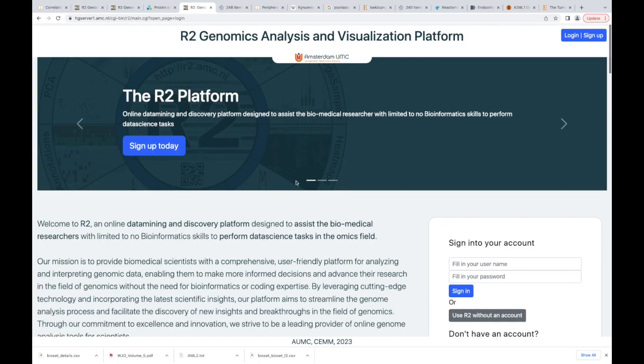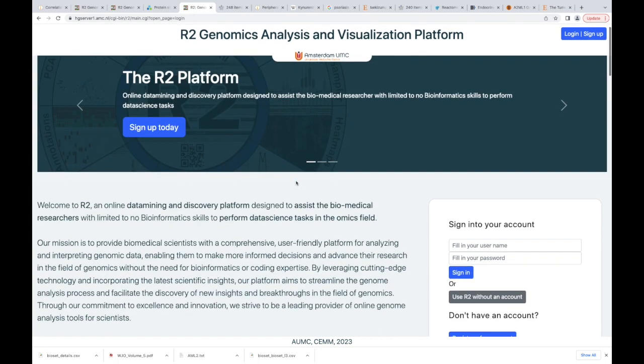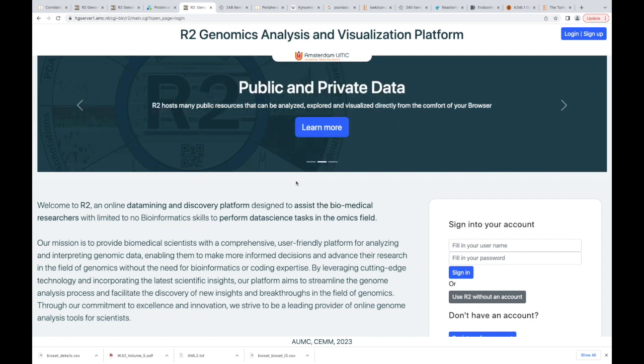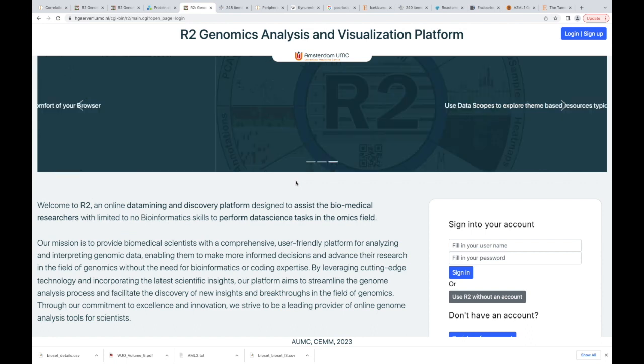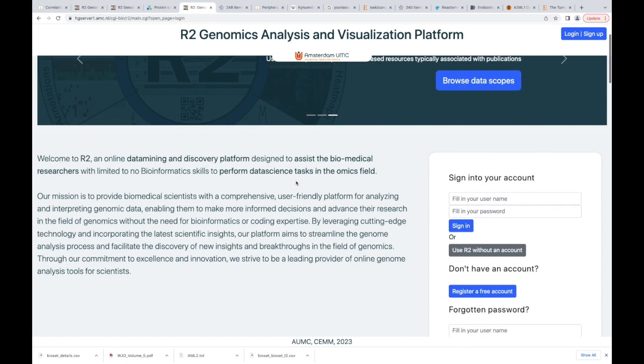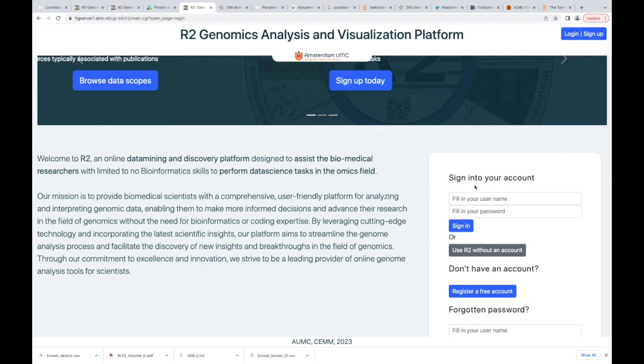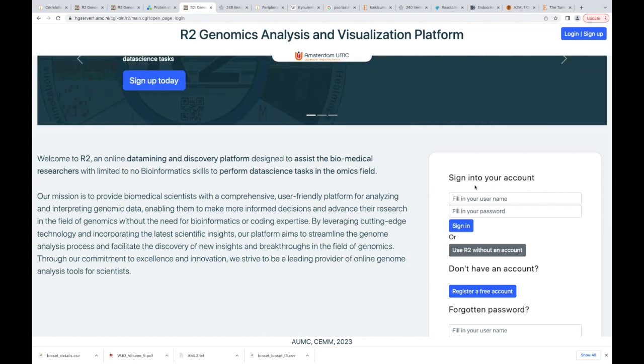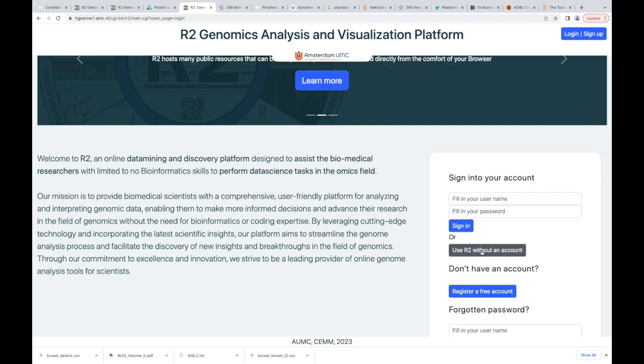So here's what we're going to do. I would recommend if you're going to use this a lot to get an account. Today, what we're going to do, we're just going to use it without an account. But in the future, what it allows you to do, if you get an account, you can save gene lists. There's also a lot of other functions that open up for you in this website. So let's use R2 without an account. So hit that button.